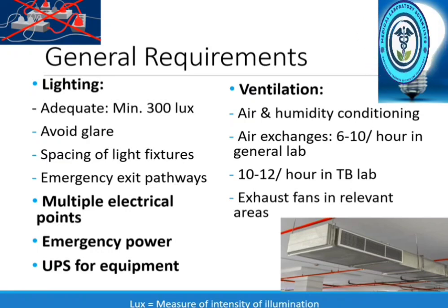Power supply. There must be multiple electrical points so that all equipment, including microscopes, may be connected directly to an electric point, thus avoiding the need for extension cords and multiple pins into one electric point. There must be a provision for emergency power supply in case of power outages, and the emergency exit pathways and signs must be supplied by this emergency line. The laboratory must also have a UPS for the equipment.